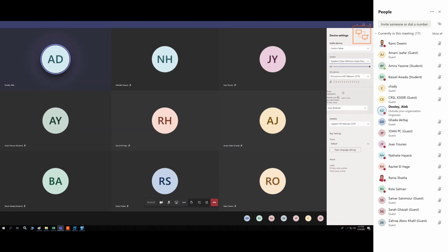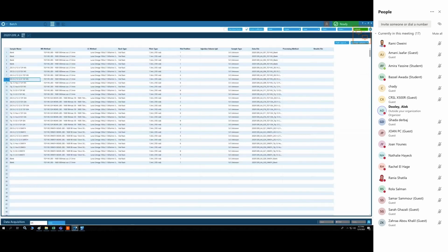What happened to the OS? Okay. And how much solvent is left in the bottles? We do need to take that into account. Okay, we are adjusting a little bit the level of the water. We are adding 500 ml to be on the safe side. Okay, great.